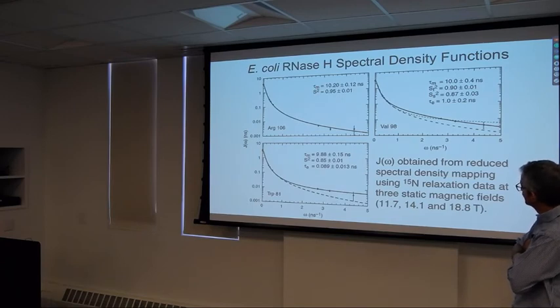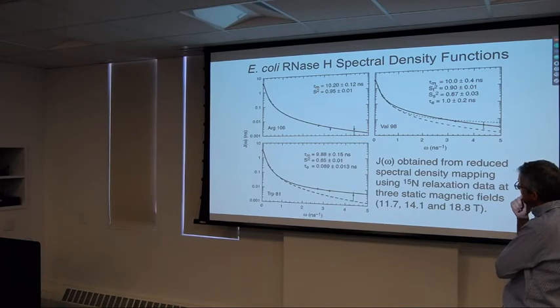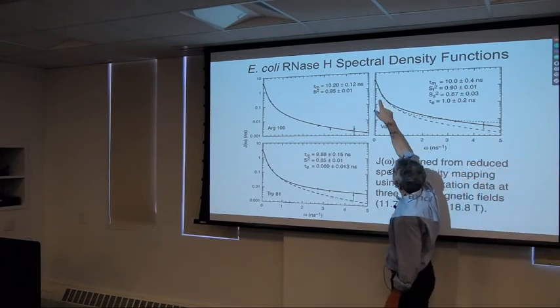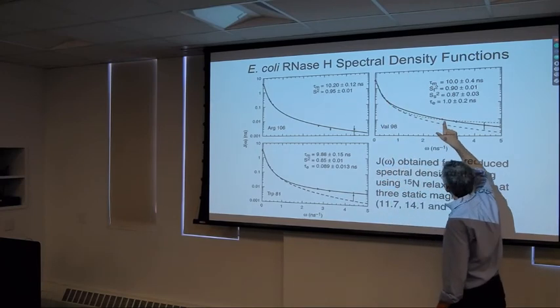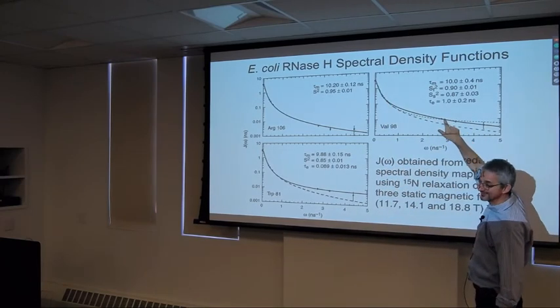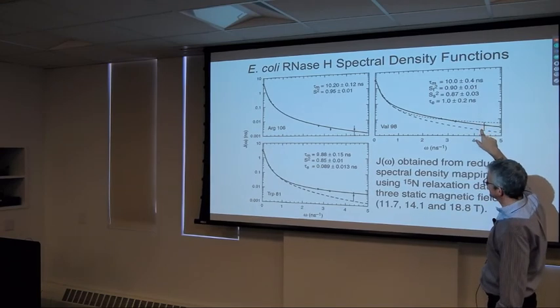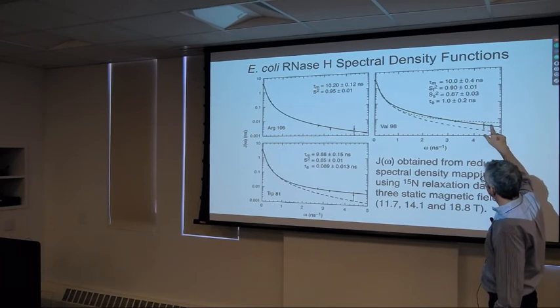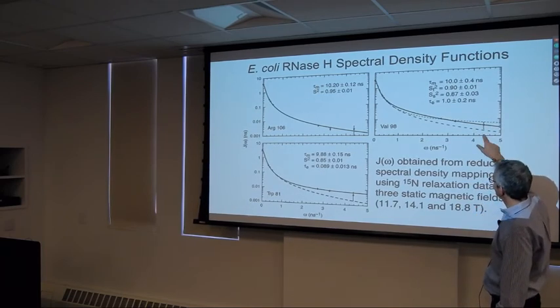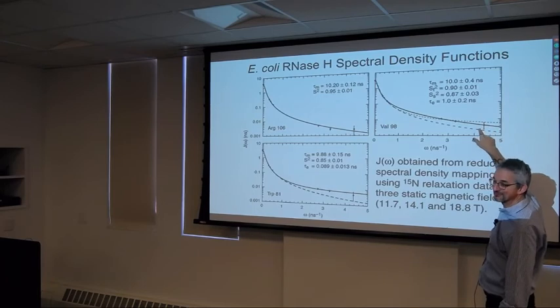The frequencies at the beginning are all fit virtually identically by all the models. It's the data out at the hydrogen frequencies that are really distinguishing the models. The error here is just because these are old data, and way back when we could get very limited time on an 800 megahertz spectrometer.